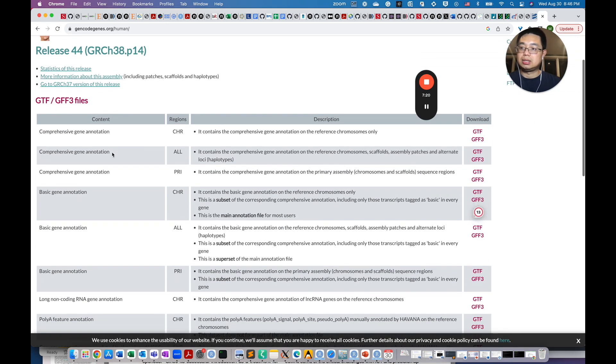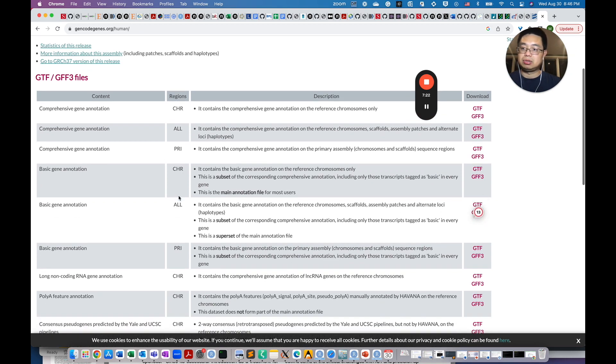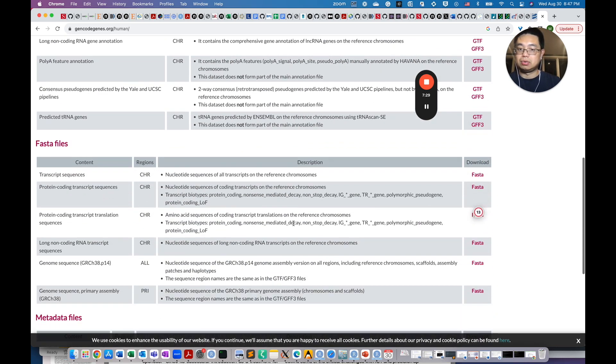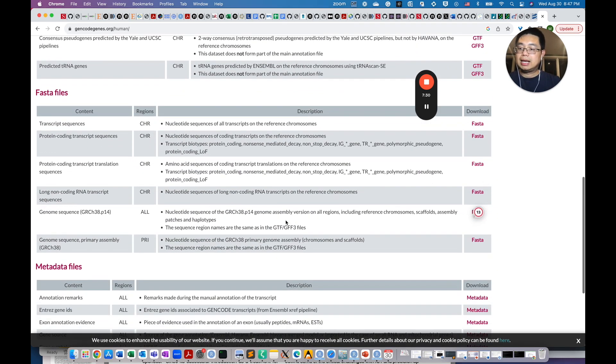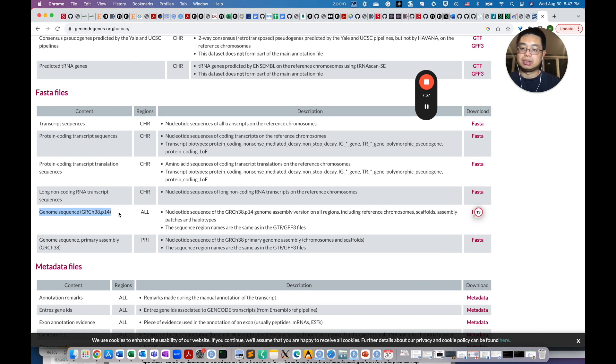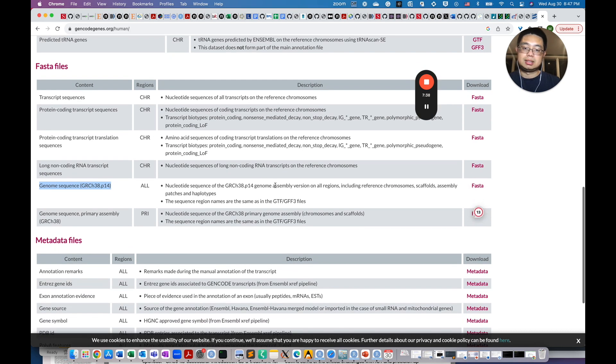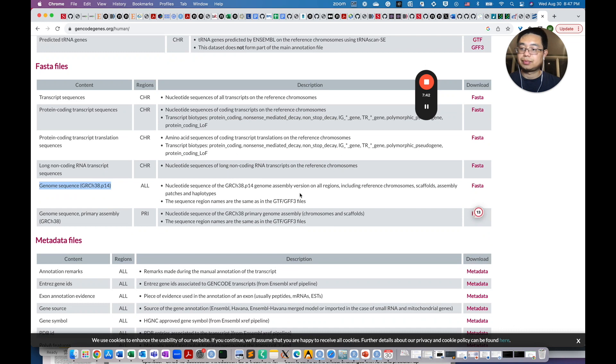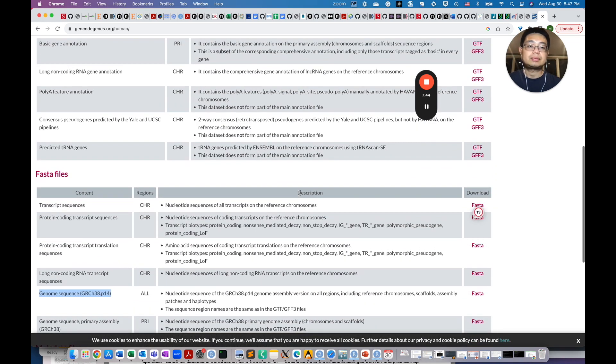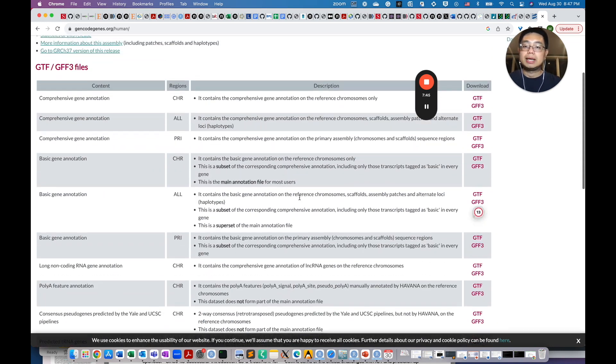Then you see this page. And then you see the GTF files, the gene annotation file, multiple files here. Then you read the description to see which one that you need to use. And the FASTA files. Then this is the transcript sequence, essentially that's transcriptome. And then you also have the genome sequence. This is the DNA, essentially the genome file.